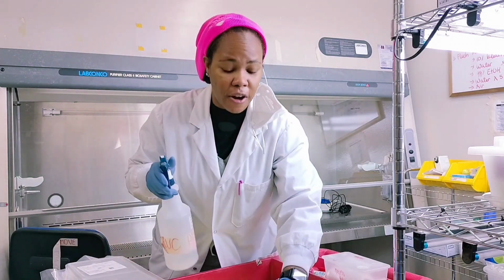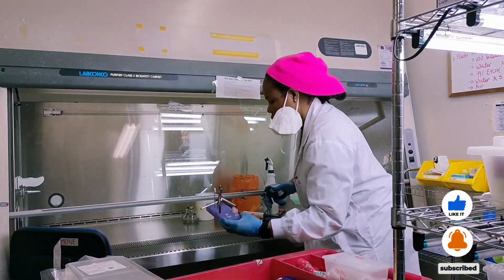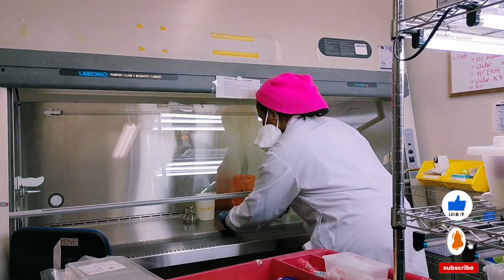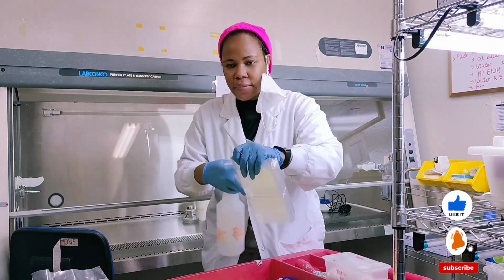Because remember, I'm making up fungus. I'm growing fungus. This is just a test tube rack. Microcentrifuge tube rack. And then the plates, the petri dishes that I'll be using.